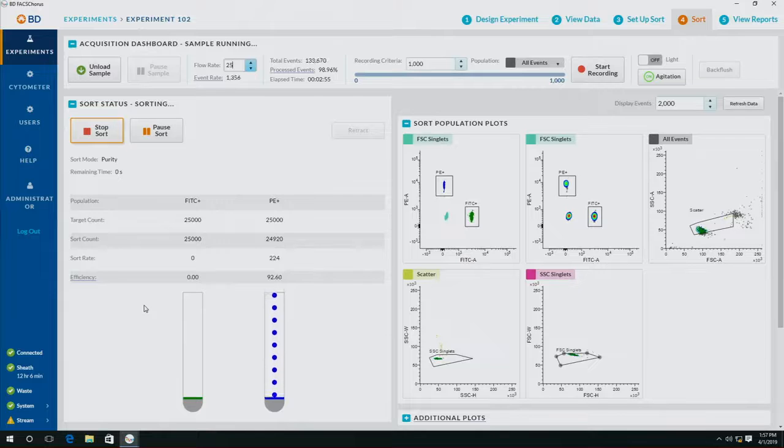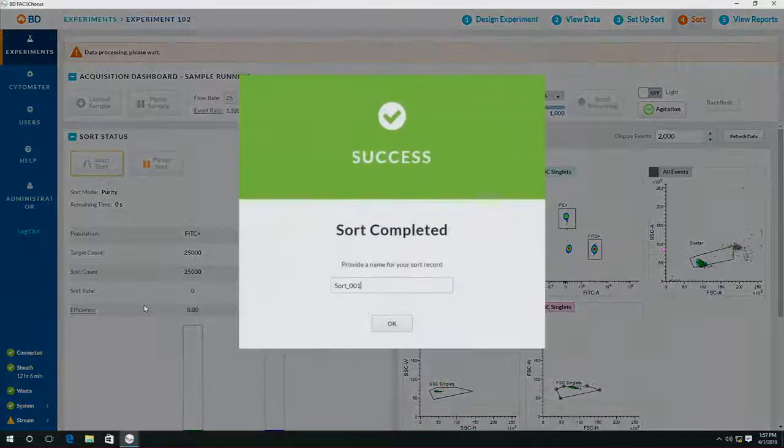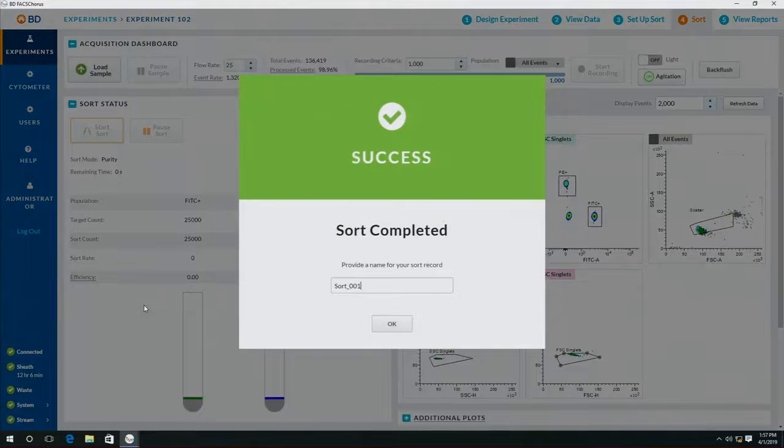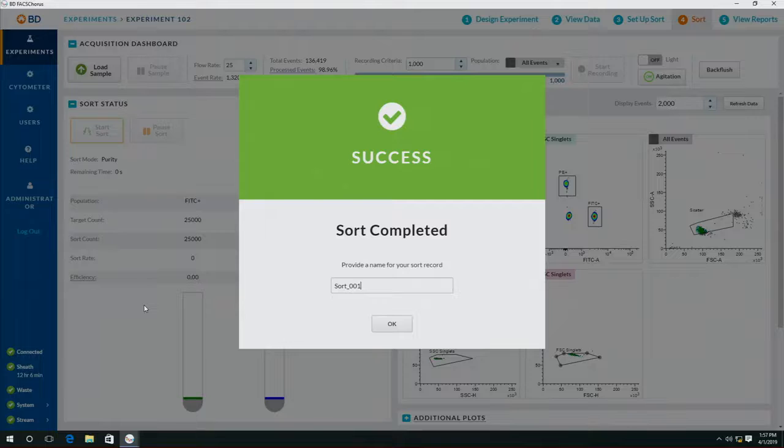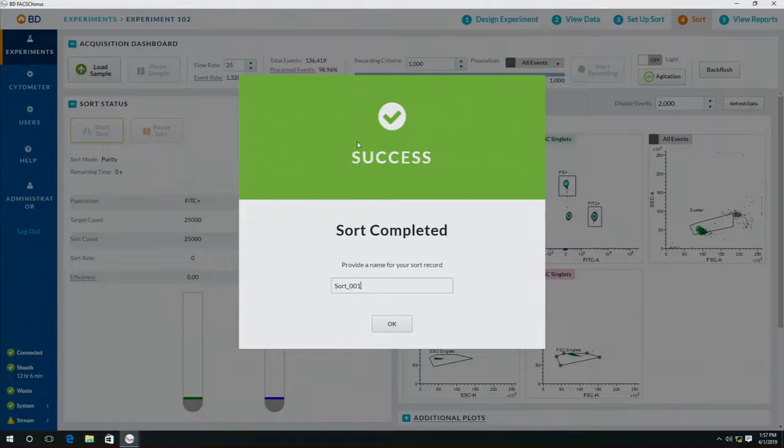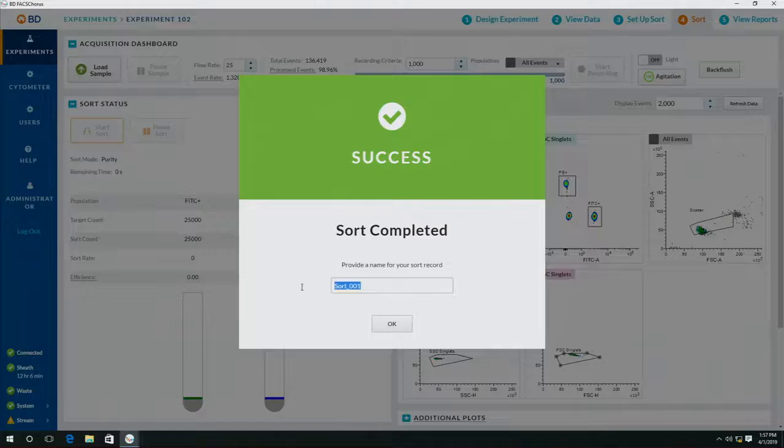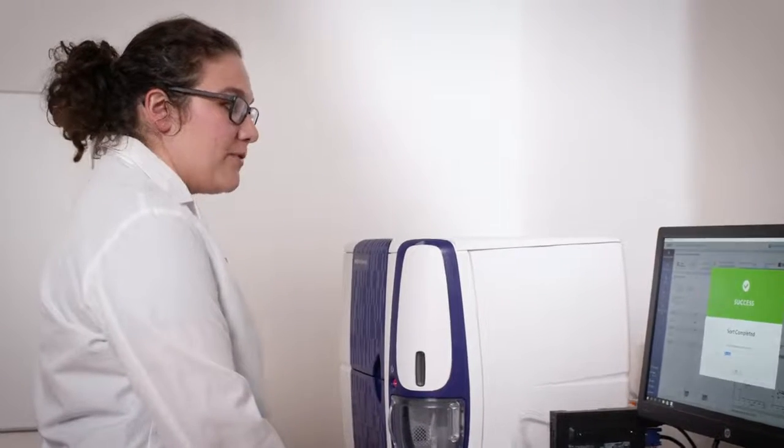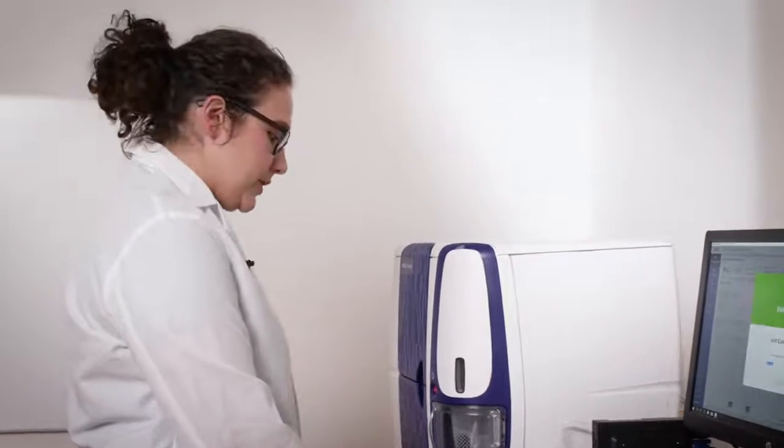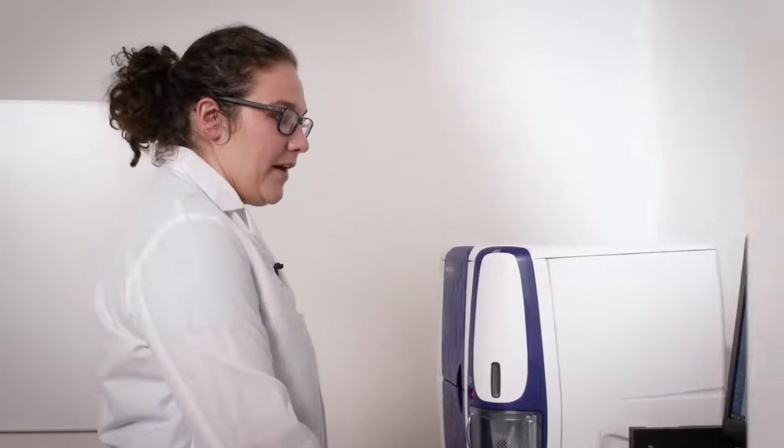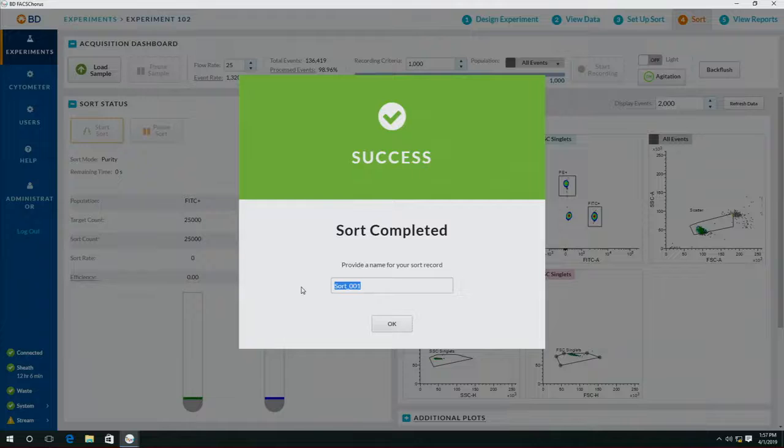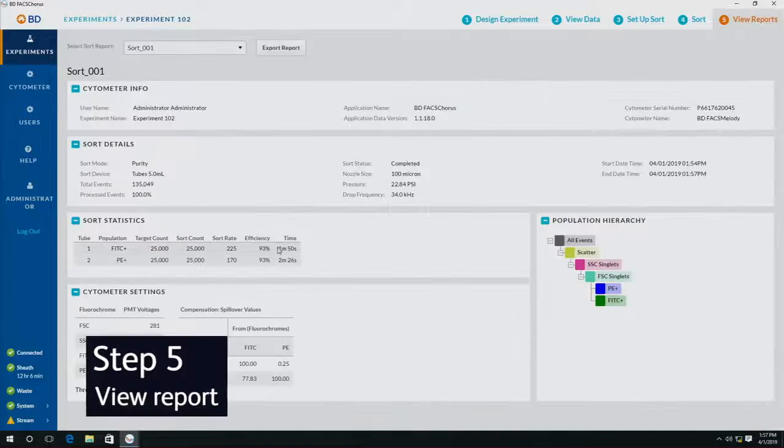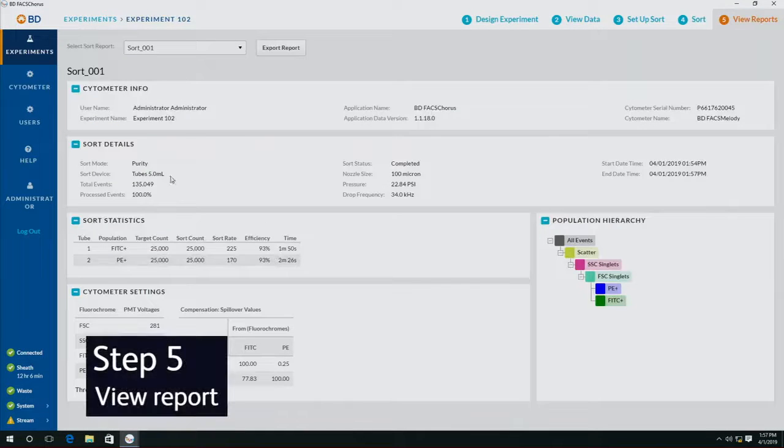Success! Once your sort is completed, it's going to tell you on the screen here that you've collected the number of events you wanted. You can provide a name for the sort records. I'm going to call it sort 001. We can go here and see the sort report, so it tells us how much time it took, what was the efficiency, how many events we collected.